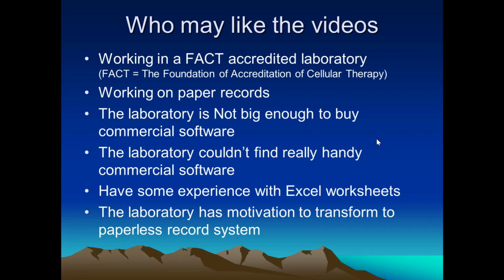Who may find this video helpful is if you're working in a FACT accredited laboratory and using paperwork records. The lab is not big enough to spend lots of money to buy commercial software, or the lab couldn't find good commercial software.